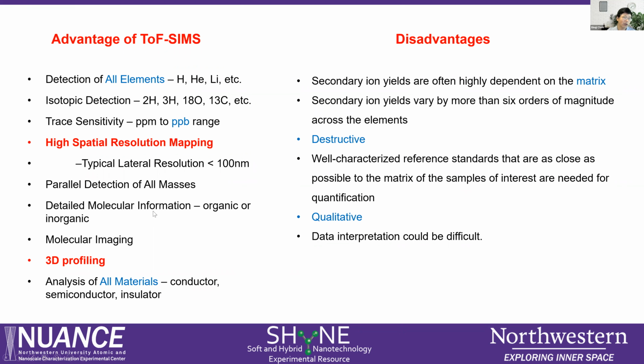And the detailed molecular information, and especially for organic sample, and they get a big fragment. They can get like this, and the big fragment you can put together. You can give you the molecular information. You can also fragment mapping, and then go to molecular mapping. And the 3D, we can do the depth profile. We can do the 3D rendering.